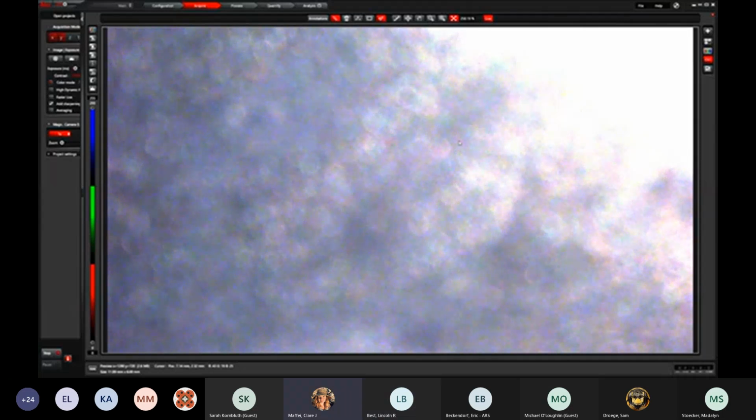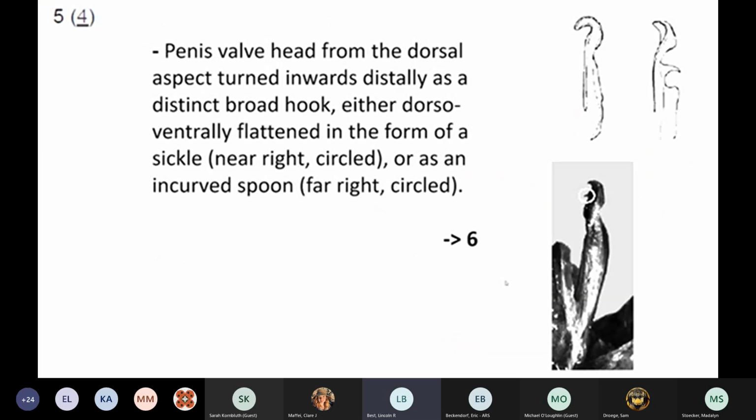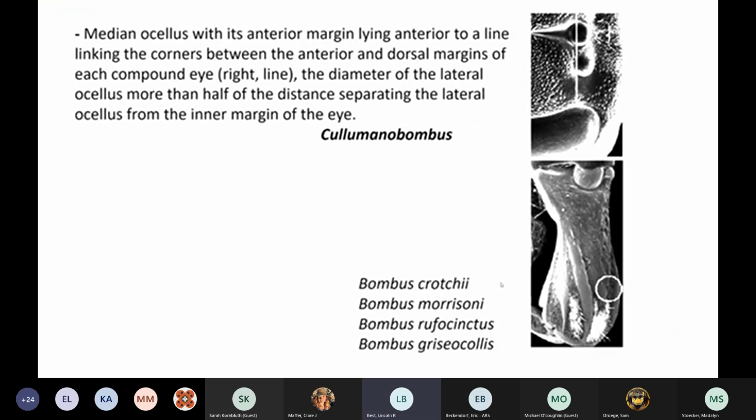So we were just hoping, going back up to the females, if we could, with the mandibles, locate the anterior versus posterior side, in guides, and would it be possible to see those mandible notch differences in couplet 5 under the microscope? Oh yeah, and that's maybe one of the more difficult things. So let me just flip back to the key. Couplet 5.